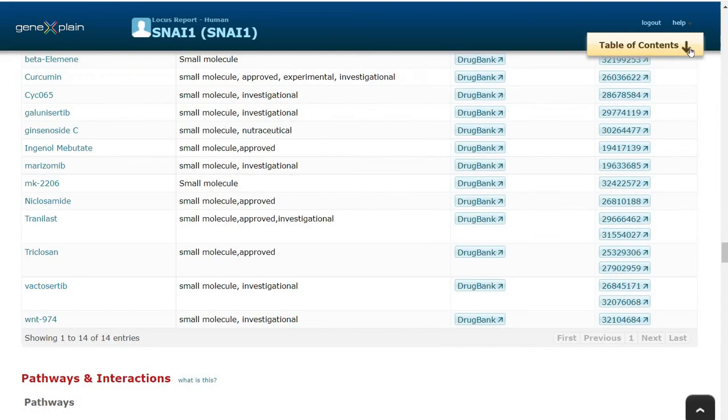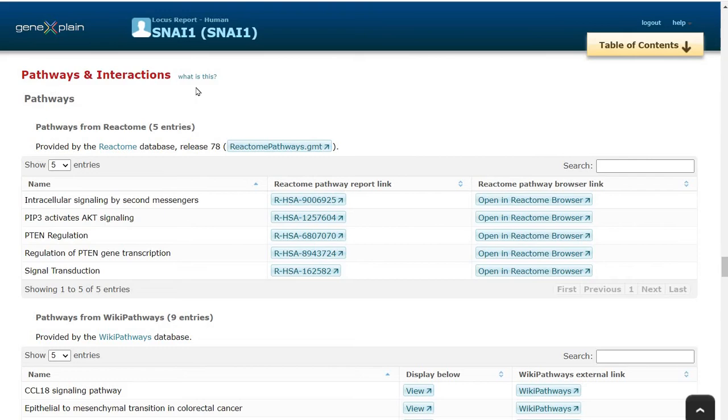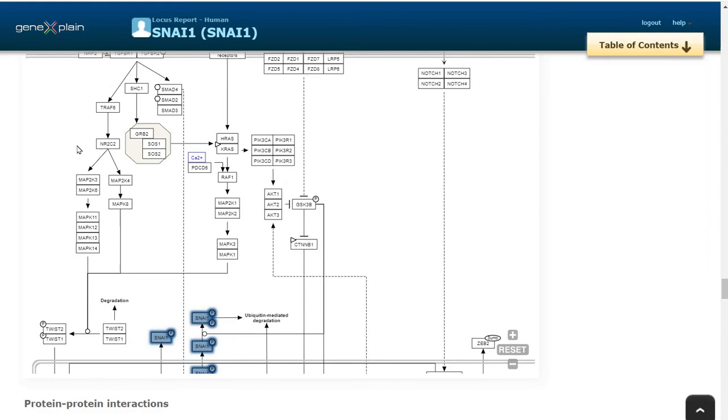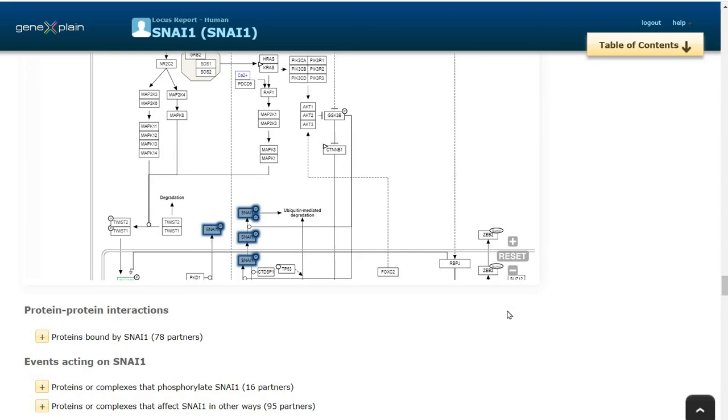We can also see the list of pathways in which this SNAI1 is involved from the list pathways and interactions. For example, the pathway epithelial to mesenchymal transition in colorectal cancer. This can be visualized here by clicking on the button. We can see SNAI1 transcription factor and its role in the pathway.